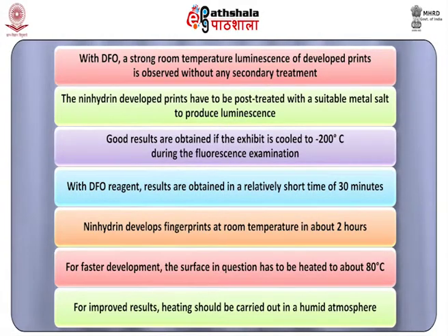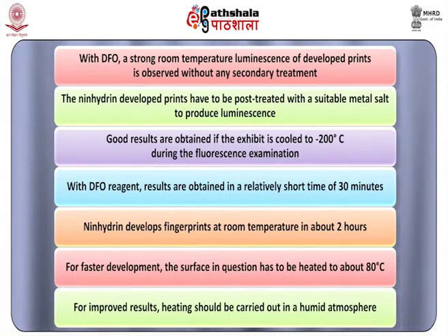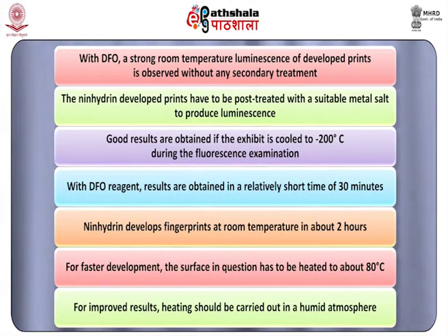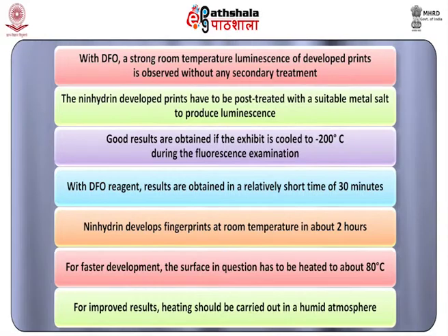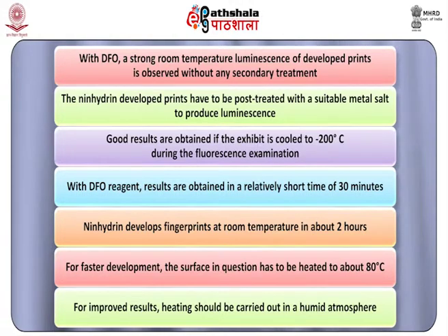Number 2. With DFO reagent, results are obtained in a relatively short time of 30 minutes. Ninhydrin, on the other hand, develops fingerprints at room temperature in about 2 hours. For faster development, the surface in question has to be heated to about 80 degrees Celsius for improved results. Heating should be carried out in a humid atmosphere.